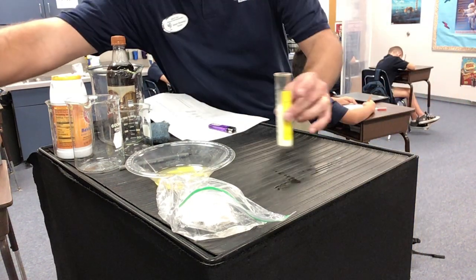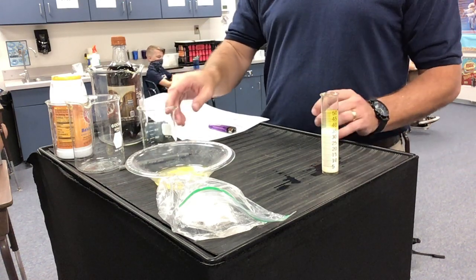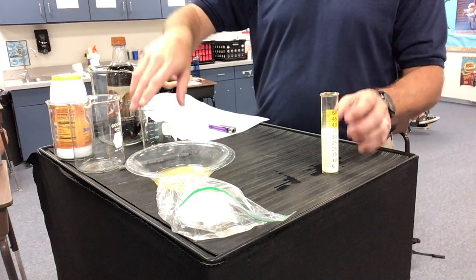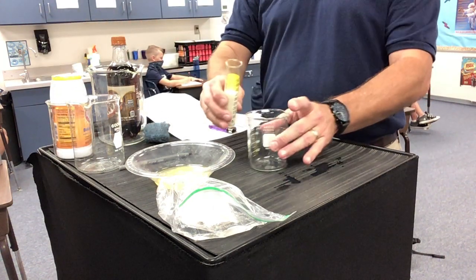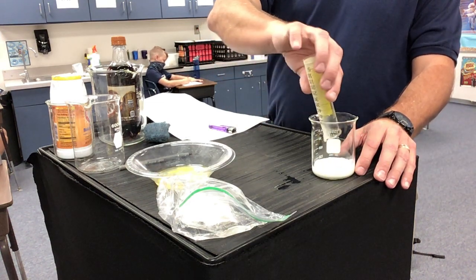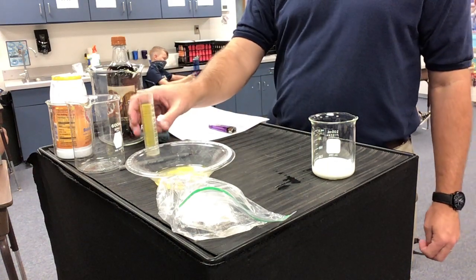Take that milk, it is now in a graduated cylinder. Looks like that. I'm going to take that milk, pour that milk into the beaker. Did it change? Changed shape.